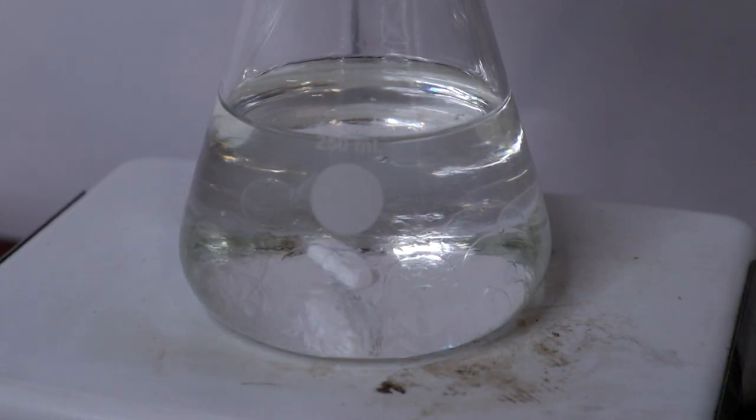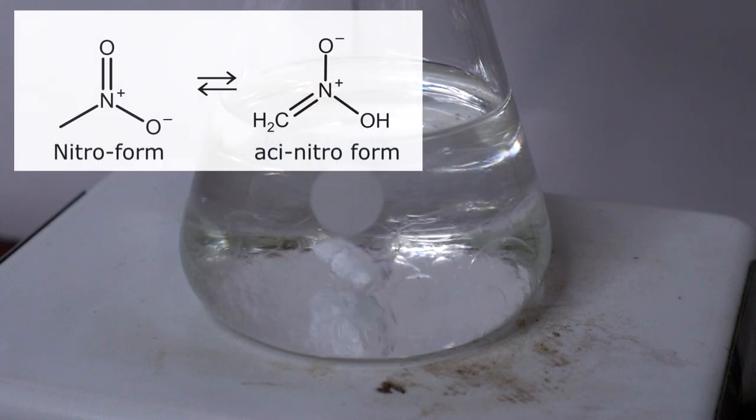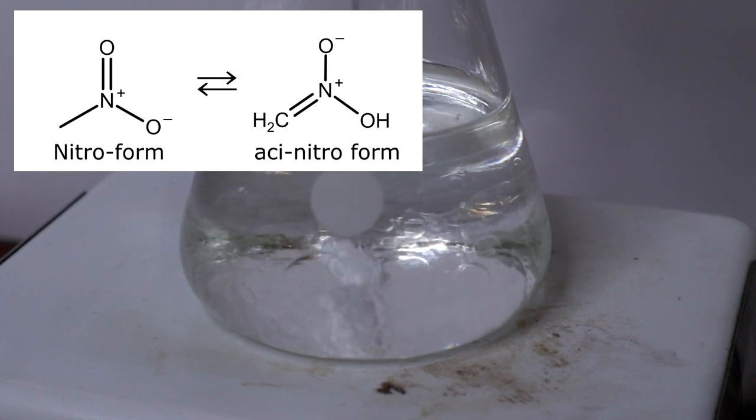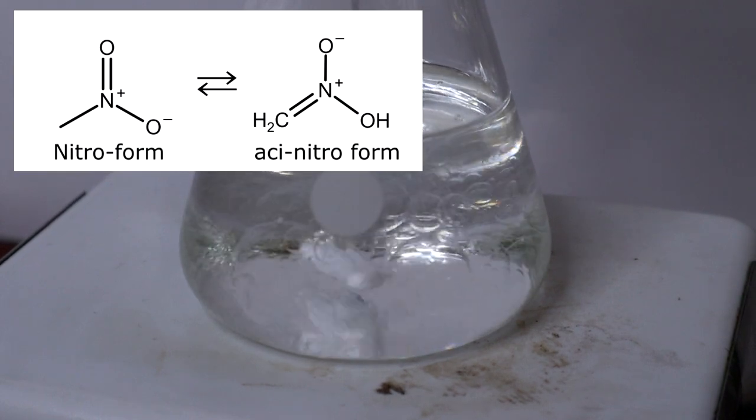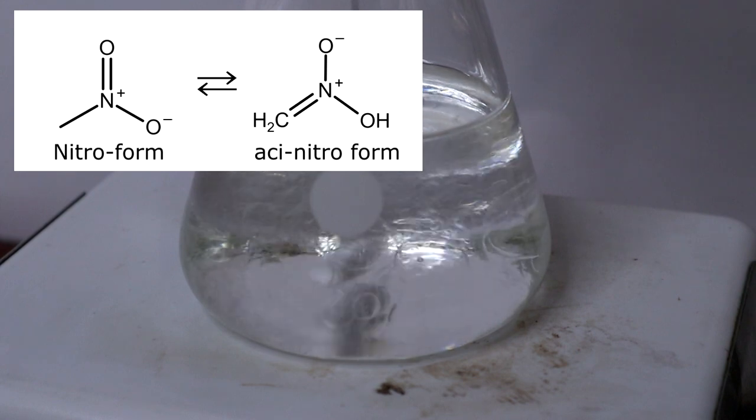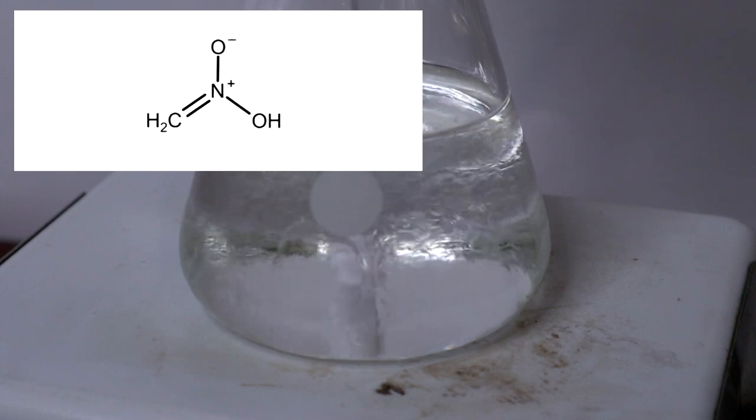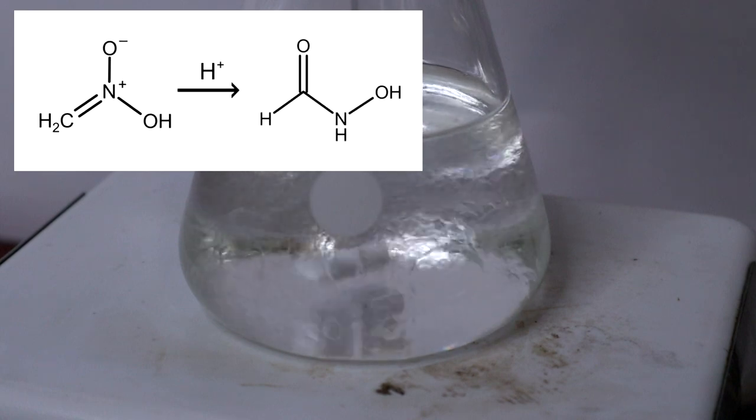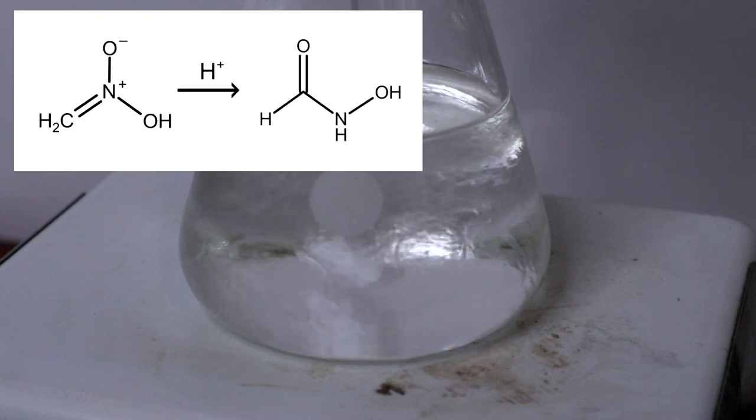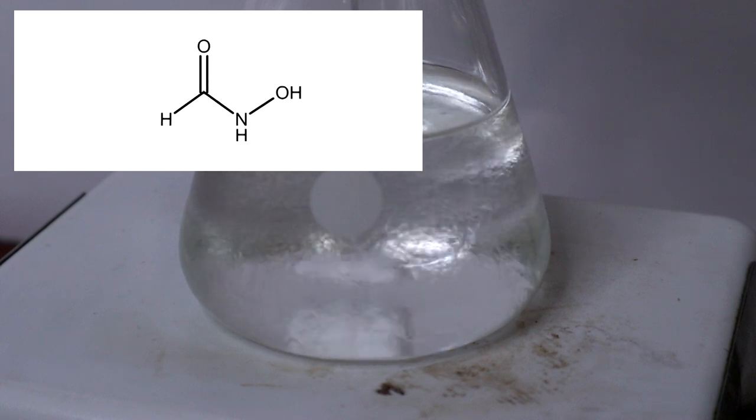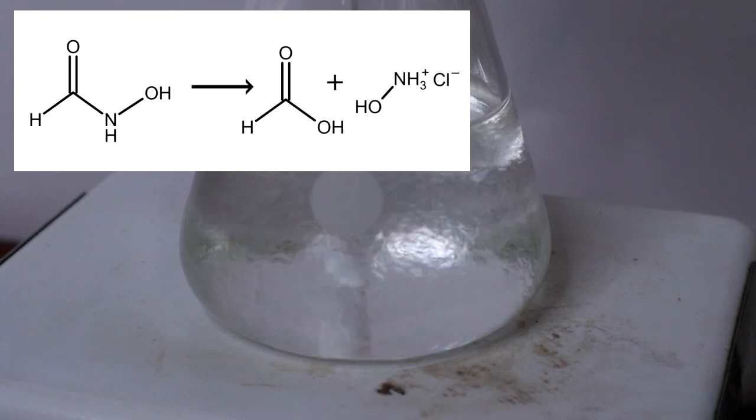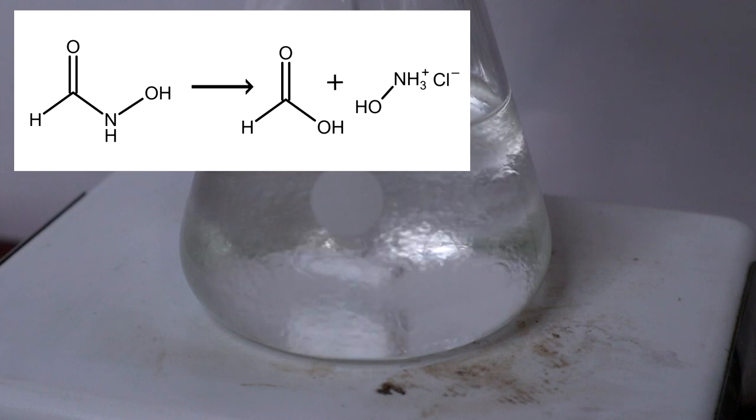So what's going on inside the reaction vessel? To begin, nitromethane is in equilibrium between two tautomers, the nitro-form and the aci-nitro form. In the first step, the aci form reacts under acidic conditions to form a hydroxamic acid. The hydroxamic acid is then hydrolyzed into a carboxylic acid, formic acid in this case, and hydroxylamine.